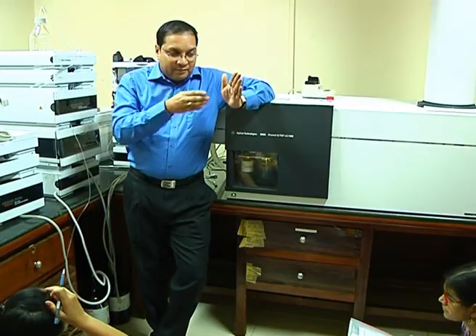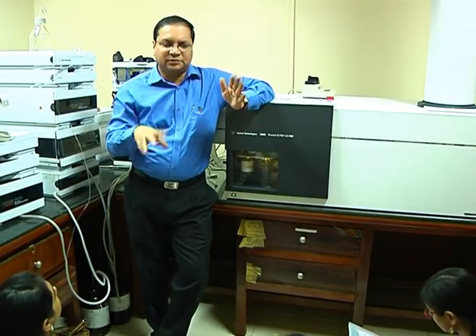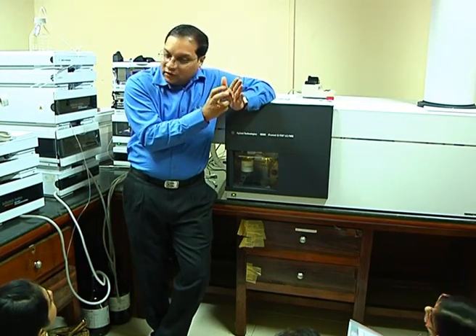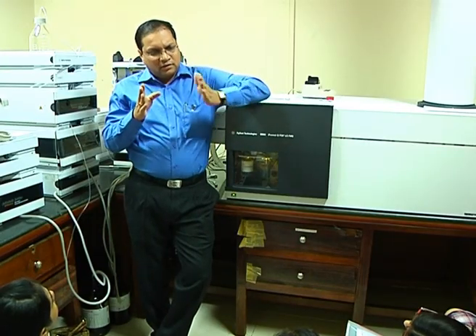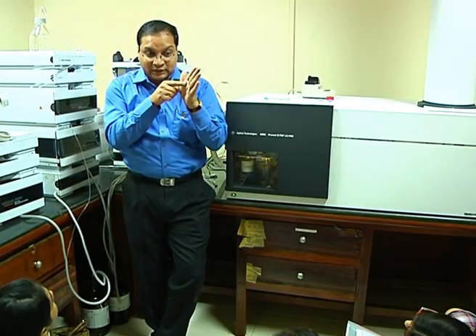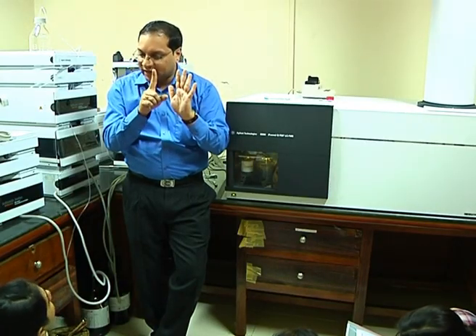And I know my peptide will not come beyond 1200, meaning I'm wasting some time scanning something which is useless. Instead, I can spend the same time to capture something which is informative. So I take advantage of the protocol to say, look for mass from 200 to 1200 only. It will filter out the others and only allow up to 1200, and that 1 second I will apply till 1200 and come back. So that is the scan time.